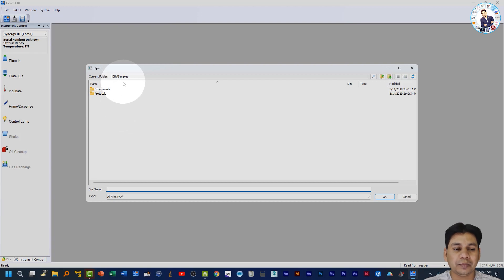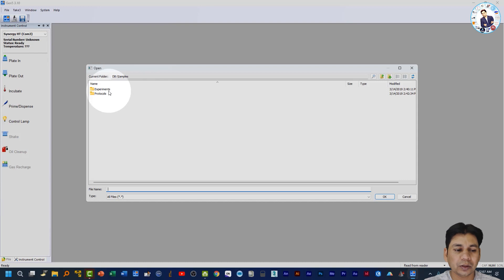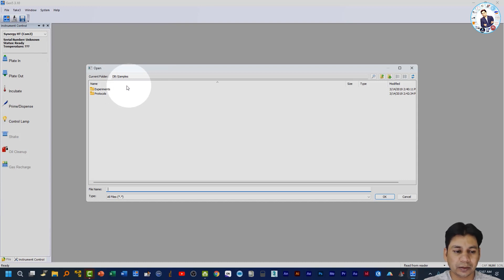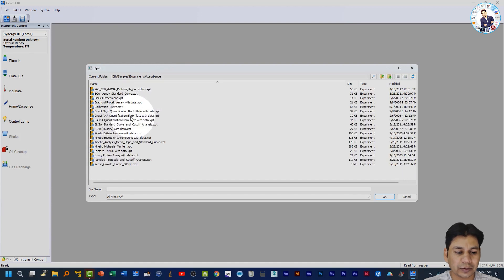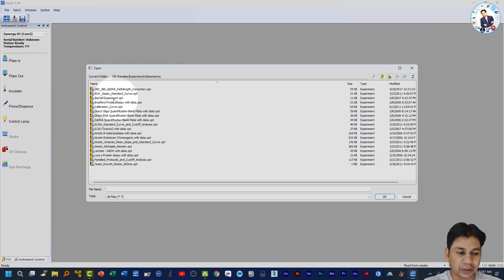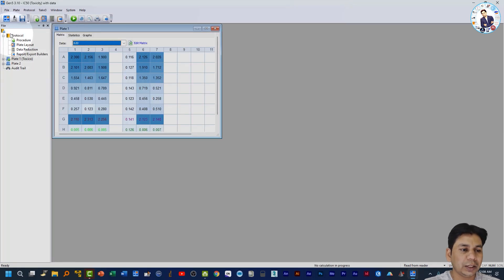These experiment and protocol files are saved in your system, but you will not find them through the File Explorer window — you have to access them through the Gen 5 software. If you click on Experiment here, you can see experiment types such as Absorbance and Fluorescence. I'm going to open Absorbance, and you can see there are many experiment files saved in your system. I'm going to open the IC50 example.